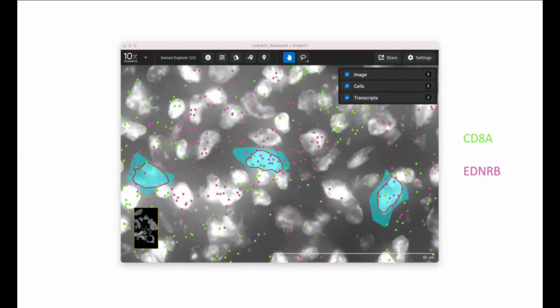So here I wanted to show an example where you can see these kind of mixture cell types. Here I'm denoting two molecules. CD8 marks T cells, EDNRB marks skin cells, and these are very distinct cell types. And you wouldn't expect them to be expressed in the same cell, but even within nuclei, you can see here this segmented nucleus, and there's both colors inside. And actually then if you make use of the full 3D information and rotate that, you would realize that there's actually a T cell nucleus beneath a skin cell nucleus, and this is actually 2 cells.